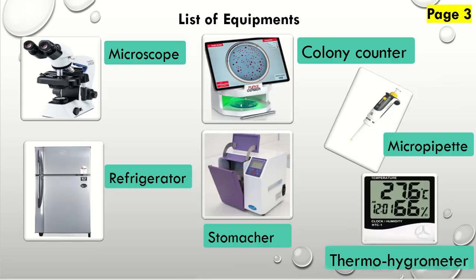And go to the next slide that contains all the other necessary equipments, just like microscopes that you normally use for checking cellular bacteria. You identify bacteria as gram negative or gram positive. Gram stain and staining kits are also required for visualizations. You can also check the motility of the bacteria using these microscopes, when it is not a powder form media. And others are also important equipment.